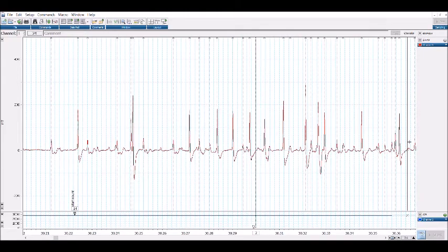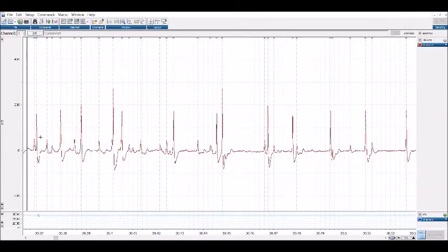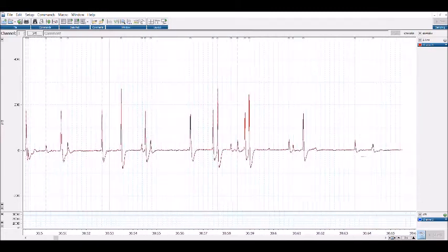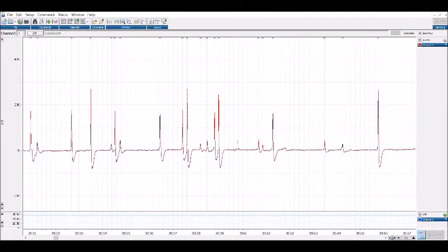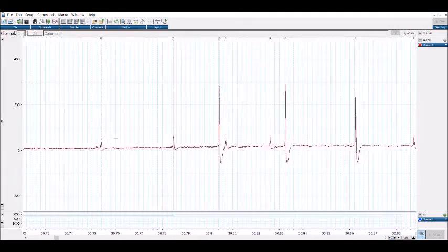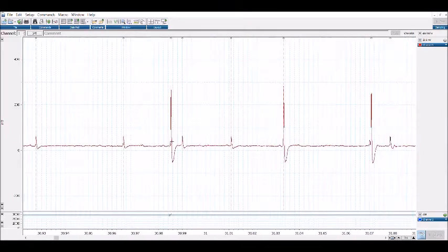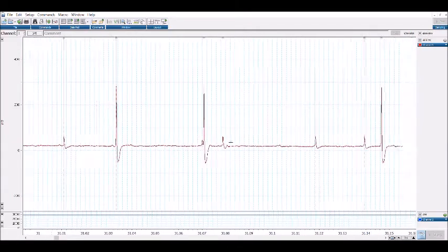And then I click to see where I was, and then just scroll. Let's see. We want this one, 1, 1, 1. Keep going, this one. And this one's pretty good. The standard deviation was pretty good on this one, so you can see it's counting most of what we want.